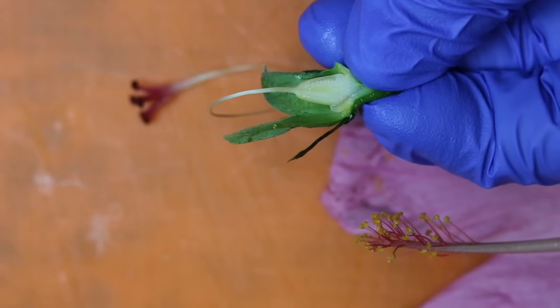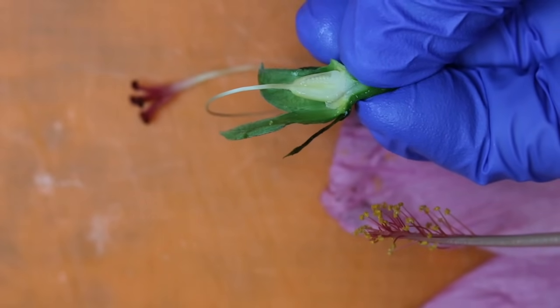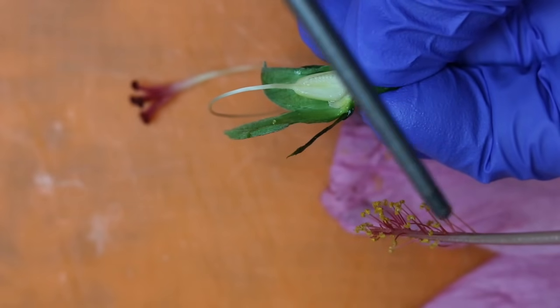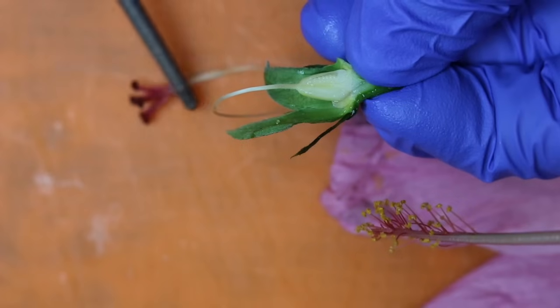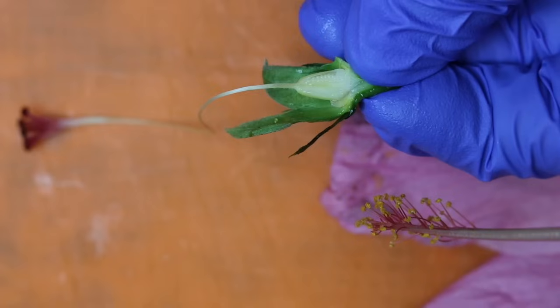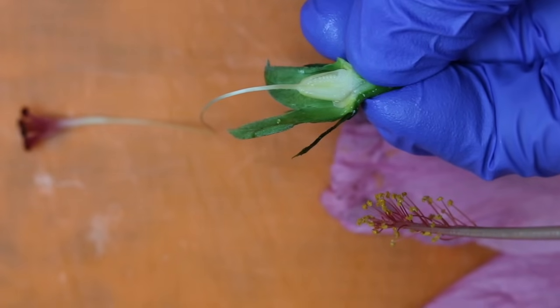Taking a closer look at the ovary, we can see those tiny little specks all along there — those are the ovules. Those are what would be fertilized by the pollen over here, coming down this tube into here, and it will fertilize the ovules that are located inside of the ovary.